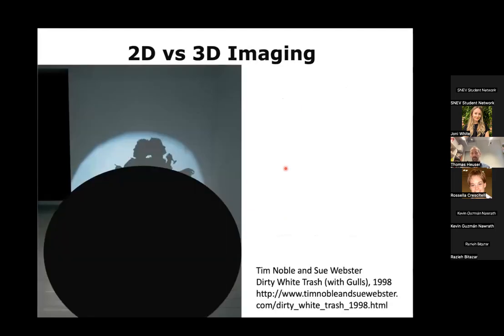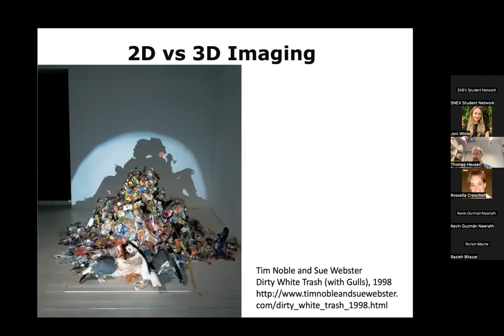So, speaking a little bit more about this 2D versus 3D imaging. I mentioned the typical image you get from an electron microscope is a 2D projection image. You can think of this like we have a 3D object here in the front, and then we shine a light on it and we look at the shadow. This would be the 2D projection image. And we might have a certain idea what we're looking at. We might be right, but it could also be something completely different.